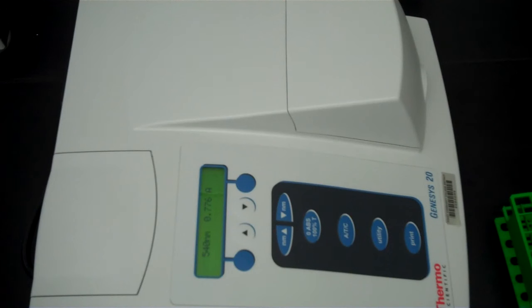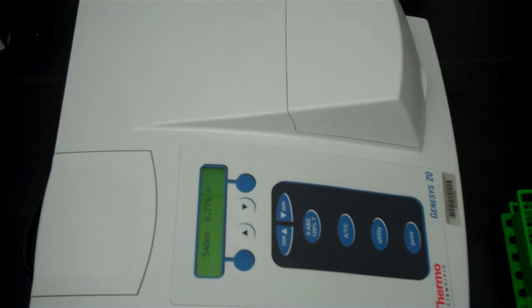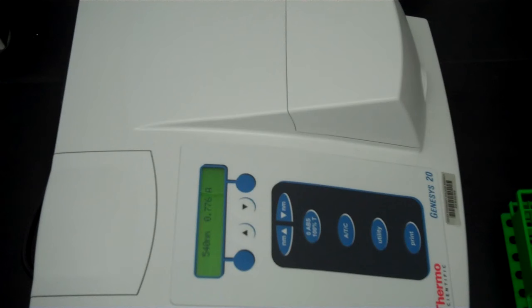You do need to re-blank the machine any time you change the wavelength. So if you have to change the wavelength, you reset the wavelength, you put in your solvent blank, and once again press 0 ABS 100% T.